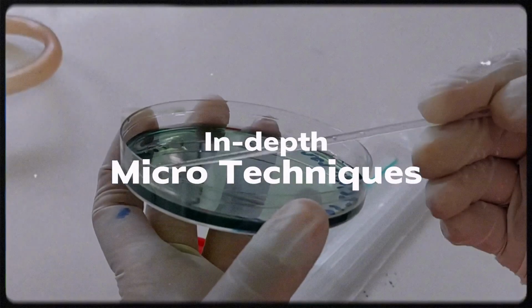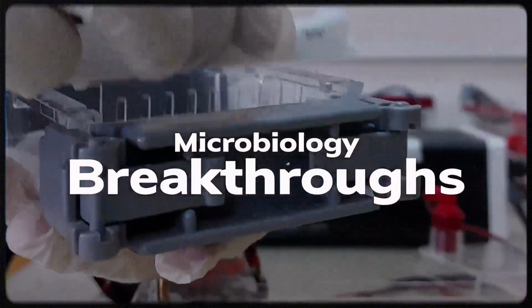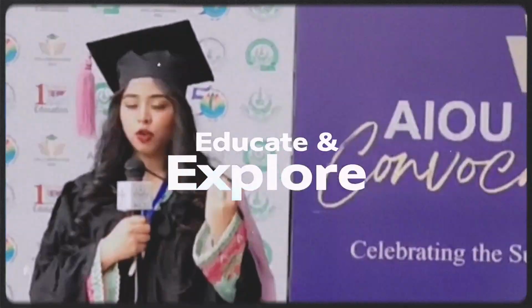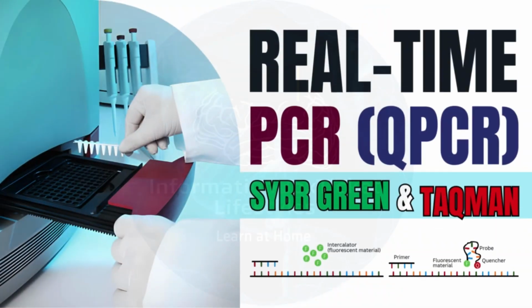Let's explore in-depth micro techniques and uncover groundbreaking insight together on this educational journey into the fascinating realms of microbes. Real-Time PCR, qPCR, explained: steps, SYBR Green, TaqMan, workflow and applications.